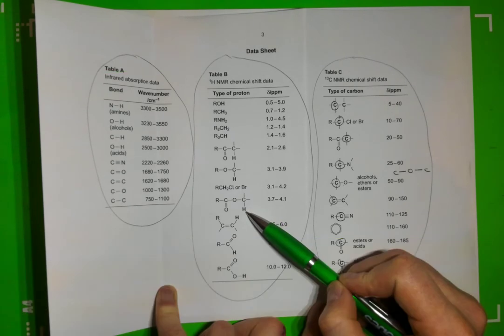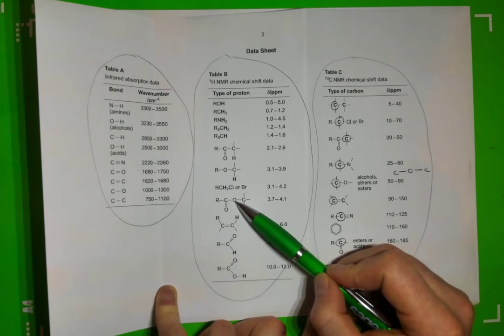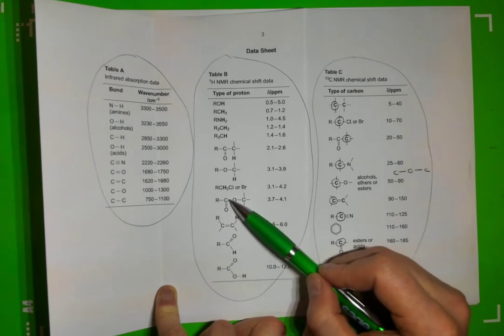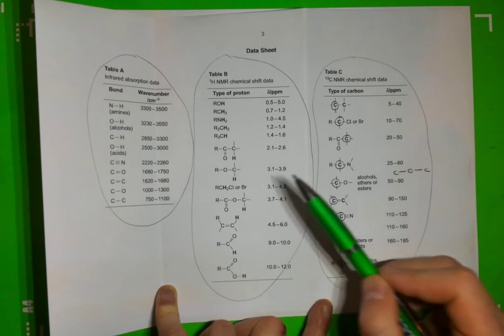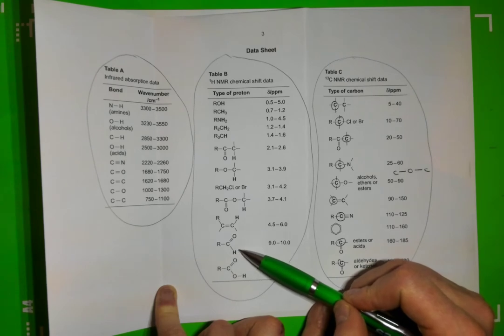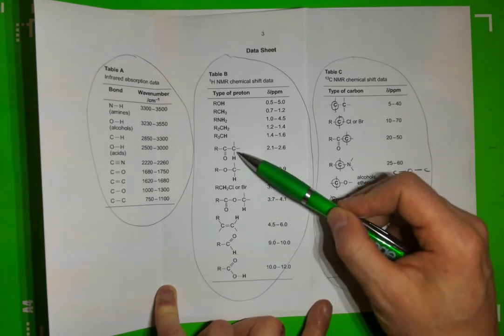We've got a hydrogen there which is attached to a carbon, which is attached to an oxygen, which is attached to a carbonyl here. So we find these in esters. We've got an alkene hydrogen and a carbonyl hydrogen. Notice this one here is different to that one there.